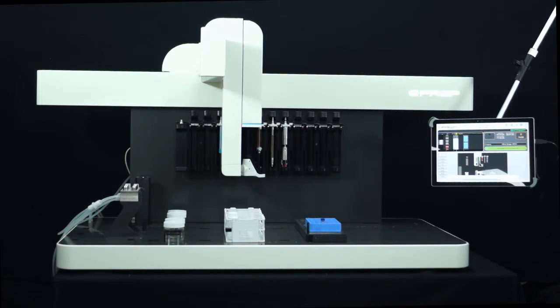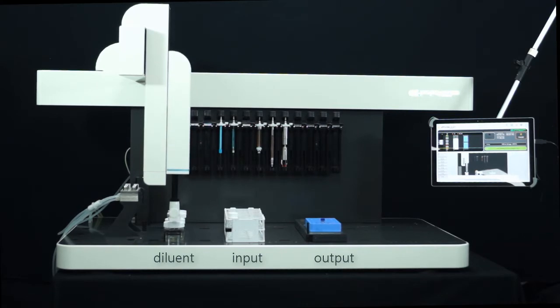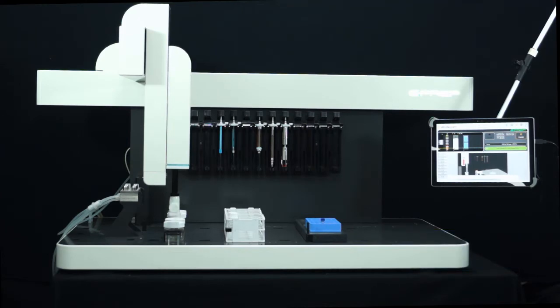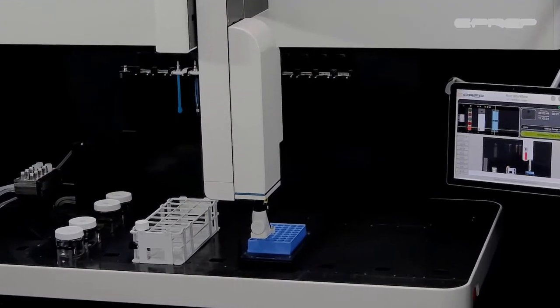The ePrep selects the 1000 microliter syringe, moves to the diluent container, withdraws 750 microliters of solvent, and dispenses this into a 2 ml vial.